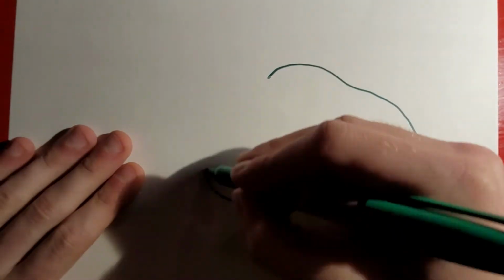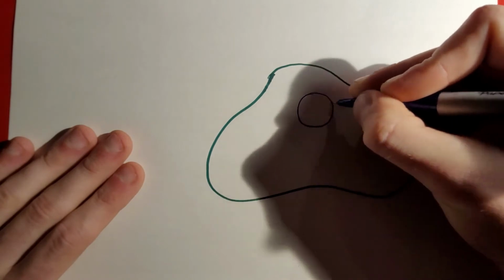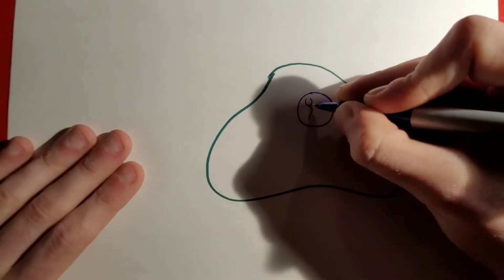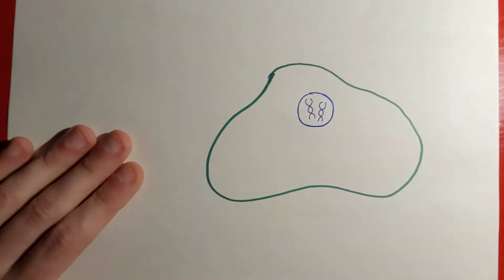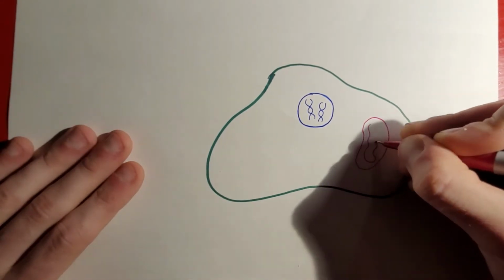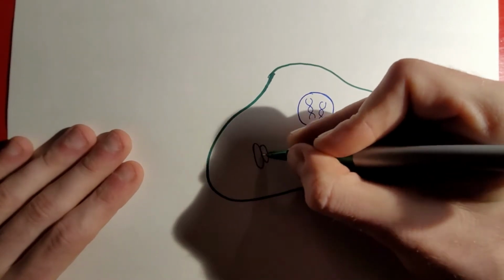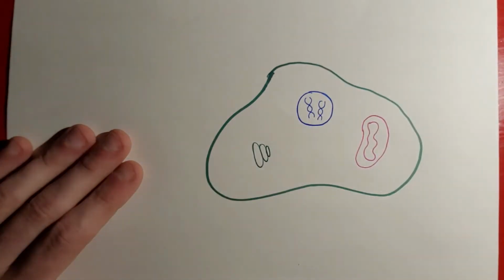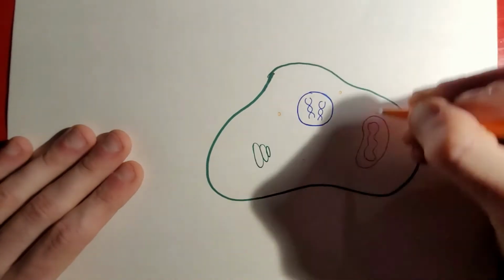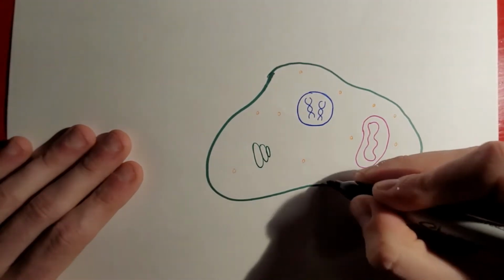Cells are complicated. If you are interested in observing an individual feature or process in a cell at high resolution, such as how the cell is adhered to some substrate, or how an individual vesicle enters or exits the cell, you may find that traditional microscopy techniques that illuminate large portions of the cell just produce too much noise. In such cases, specialized techniques in microscopy that limit your field of observation can be very valuable.